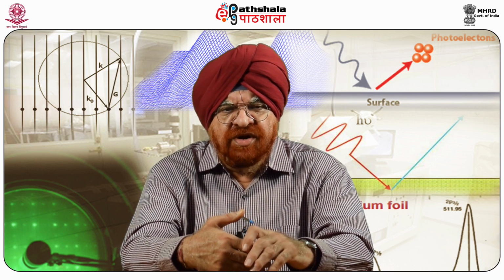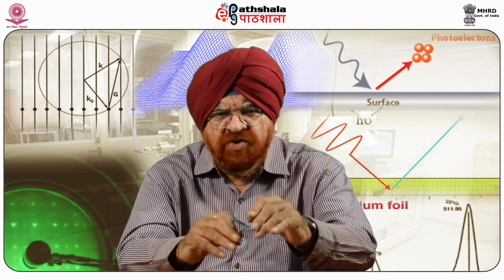So students, having learnt about magnetic force microscopy from the point of view of introduction and instrumentation, one can now summarize what exactly we have learned in this particular module. MFM is a relatively new technique for imaging magnetization patterns with high resolution and minimal sample preparation. The technique is an offspring of AFM. That means it is similar to what we use for AFM. It's a sister technique to AFM, we can say. That's why this technique is an offspring of AFM and employs a sharp magnetic tip attached to a flexible cantilever, as we find in the AFM technique also.